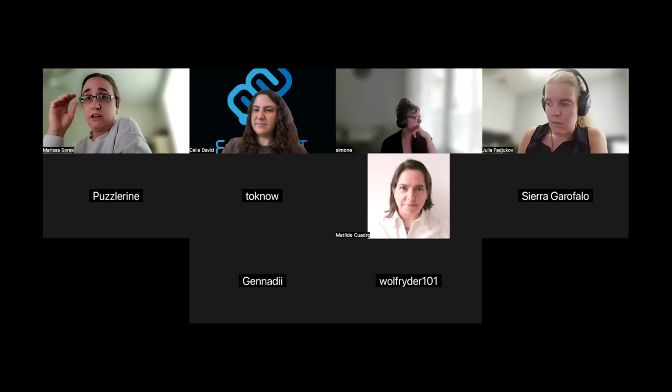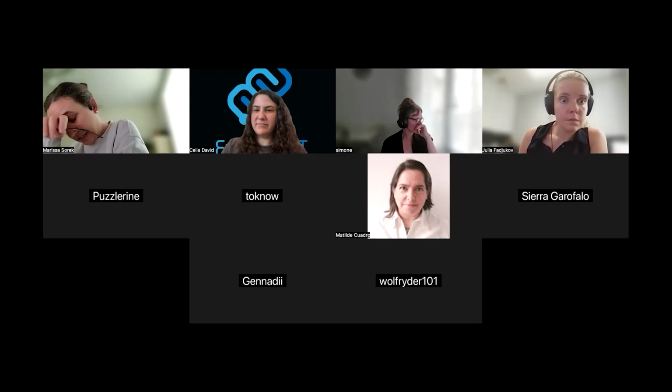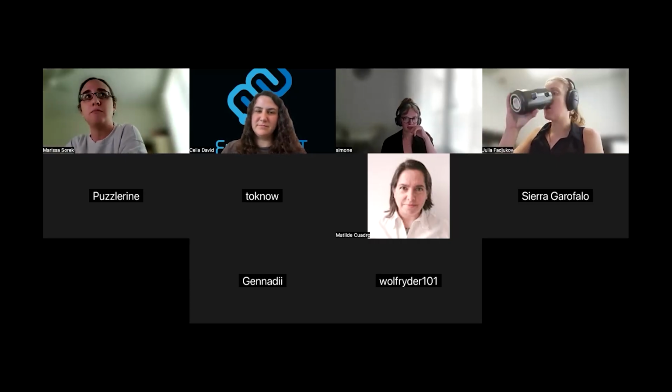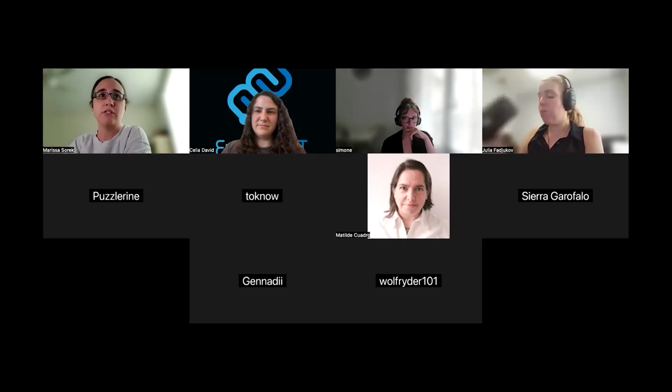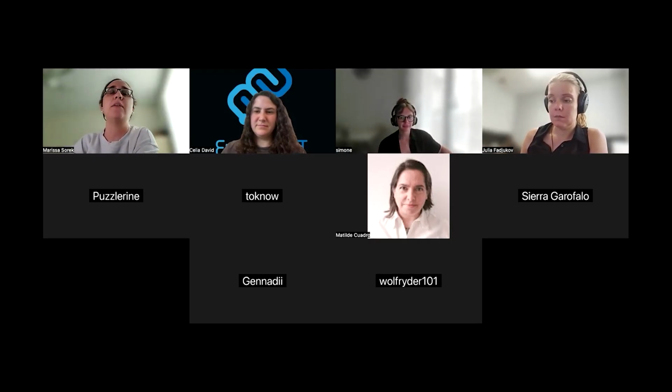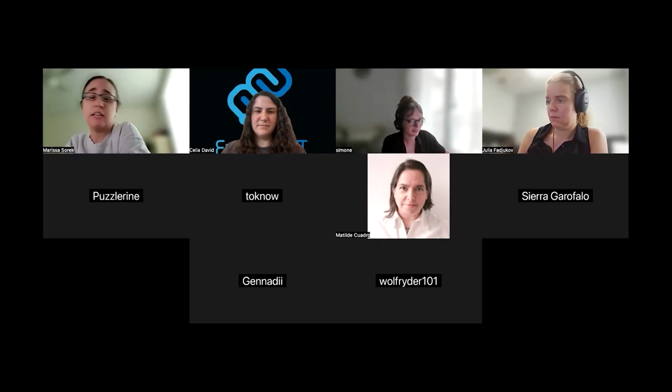One thing about how you make sure nobody's adding the same thing at the same time. It's possible, but every edit is made and updated in real time. So a best practice we suggest is to make sure you have the most recent version of a segment ID, and that will be explained in the proofreading process. Anytime you deselect and reselect that segment in the EM, it's the most recent version.